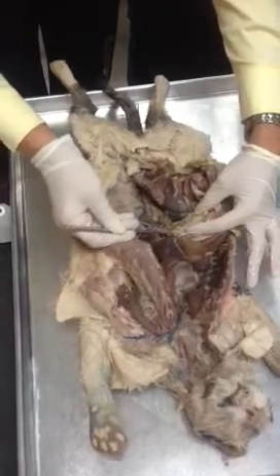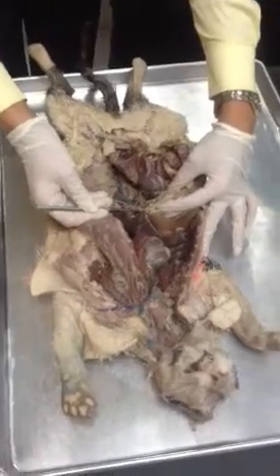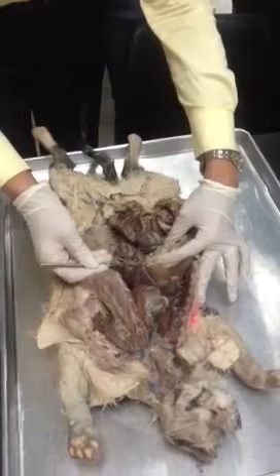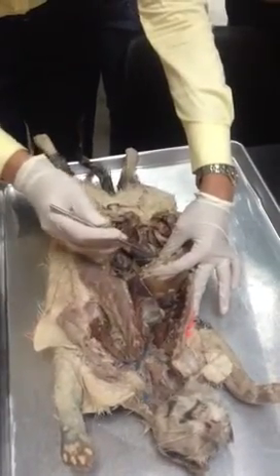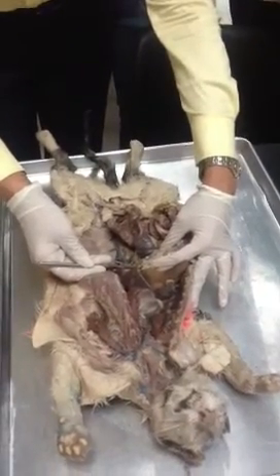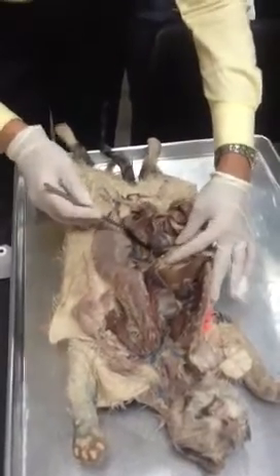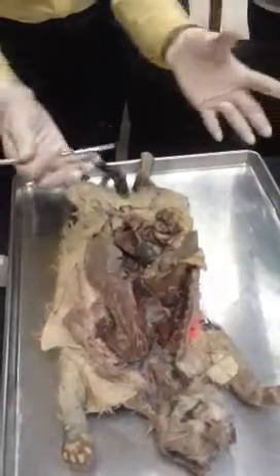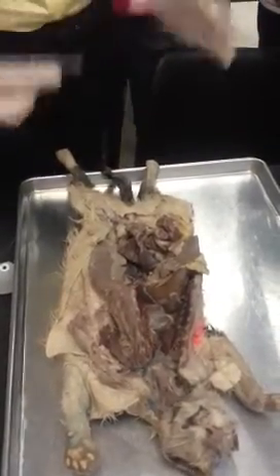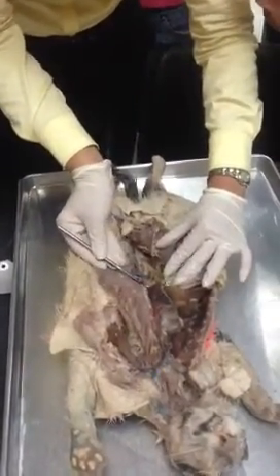Hepatic artery is relatively small considering the size of the organ, but you possibly read already that the hepatic artery brings only roughly 20% of the blood flow into the liver, and this blood flow is really rich in oxygenated blood, rich in oxyhemoglobin, but really poor in nutrients. And nutrients are coming through the hepatic portal system, and then those two bloods, and we will study that in digestive system, they mix together. Right? And that will be later. Anyway, here is that celiac trunk or celiac artery.